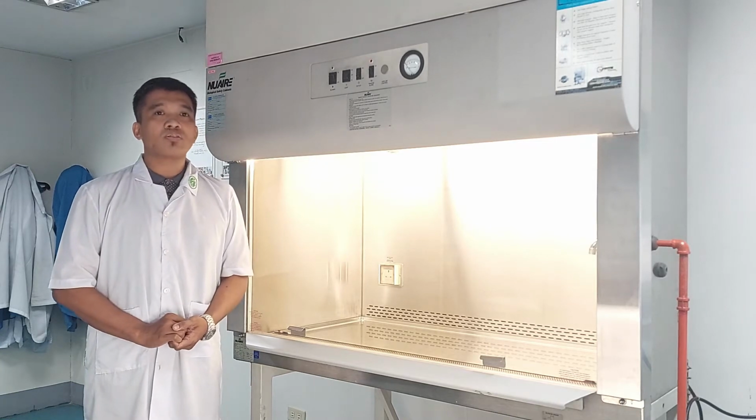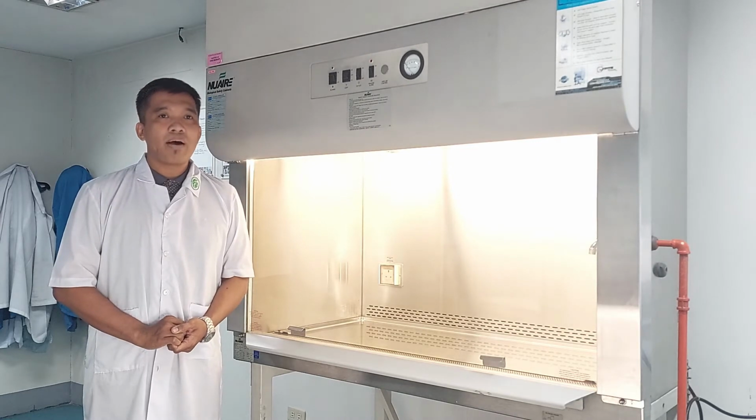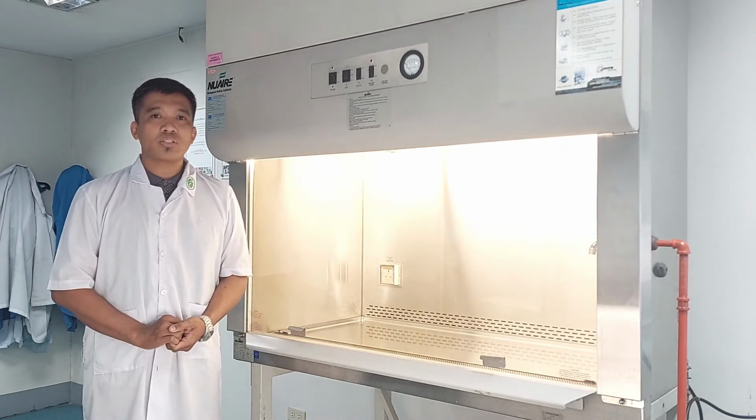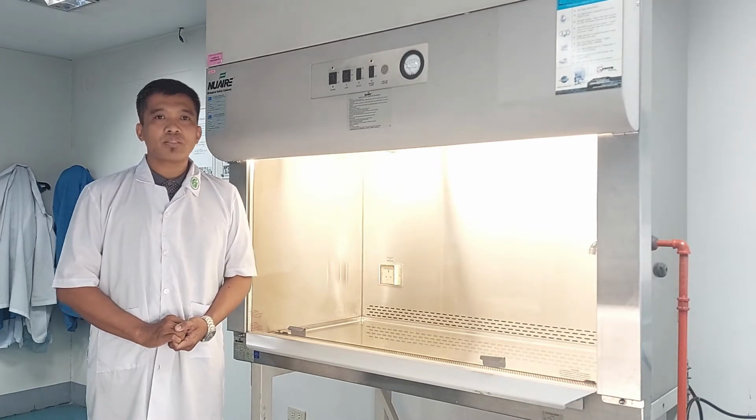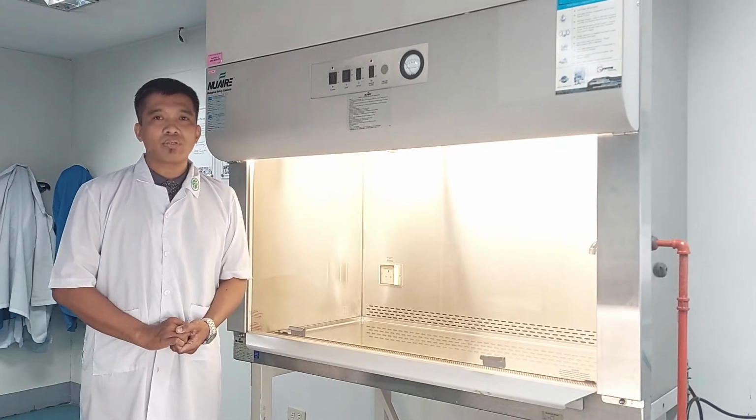One of the primary means to control the laboratory environment is by controlling the method, amount, and direction of ventilation in the area. The risk of exposure to laboratory workers can be minimized by proper use of ventilated containment equipment.